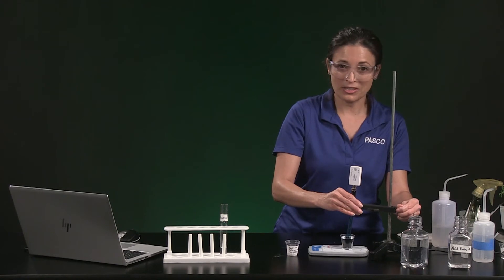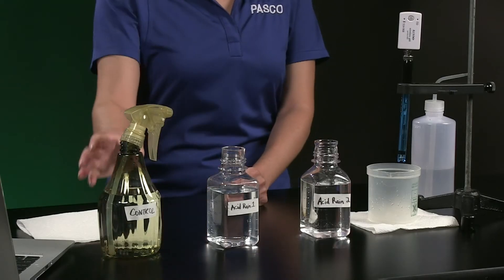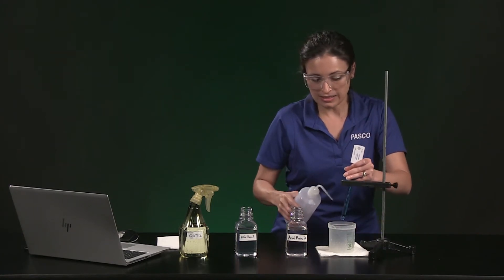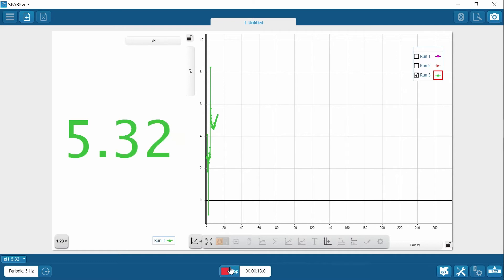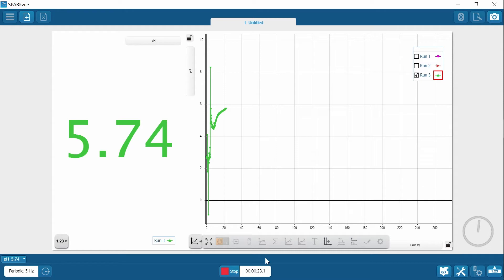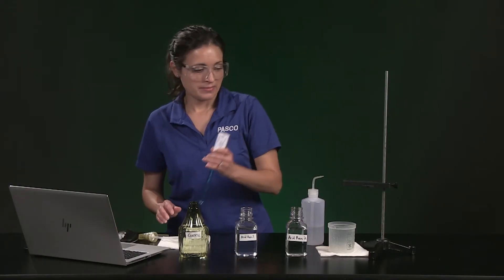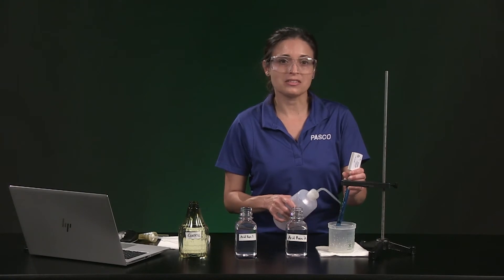I am going to rinse the pH sensor and then we can move on to part 3, where I will make simulated acid rain from distilled water and sulfuric acid. Let's start with the control, which is tap water representing ordinary rain. I am going to start collecting data and put the pH sensor in that tap water. I made acid rain solution 1 by adding 5 milliliters of 0.025 molar sulfuric acid to 250 milliliters of distilled water in this bottle.